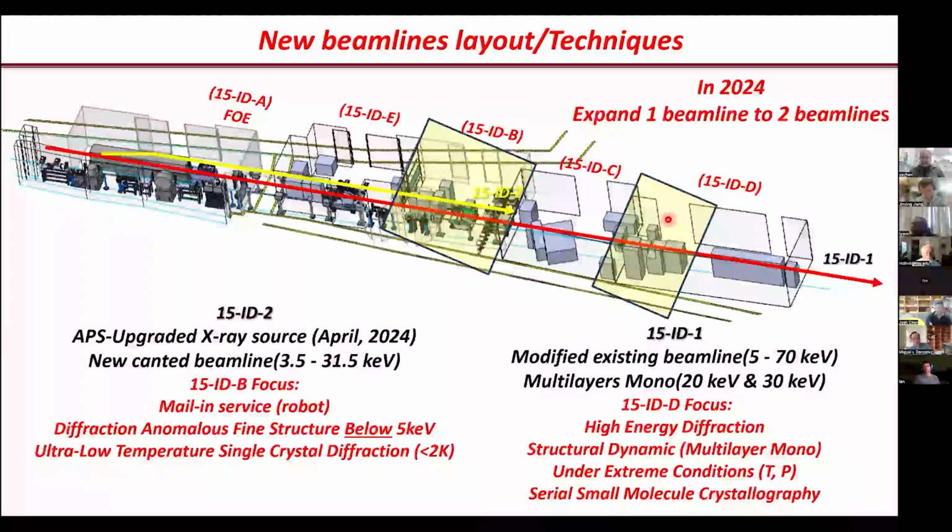The detector will be a large Pilatus 2M. Normally we operate at nitrogen temperature, but if we want to go to helium we'll see how difficult the swap is, and also the dimension and the space. Can the lower bar, the grid, go in and be changed easily? That's something we have to look at. I would not say yes, but we have to try and test. I see, thank you.